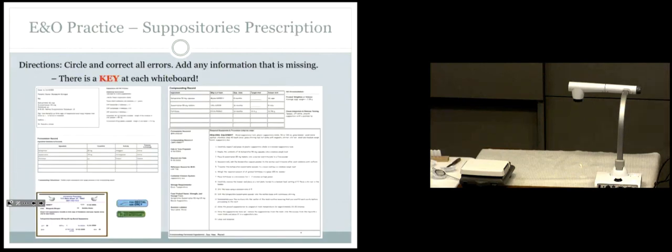Finally, that's all I got to say. Why are you still in here? Let's go out there and do it. Please ask Judy and I if you have questions or problems. Please respect the heat of the hot plate. Any issues, missing equipment, let us know. Let's go out.